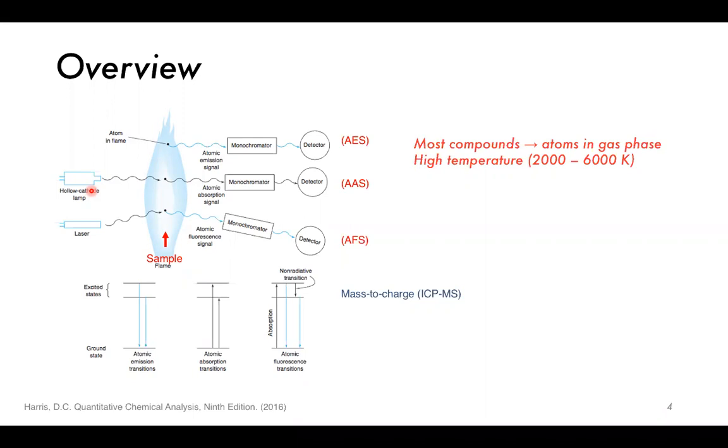that we are interested in, such that we only get absorption from the element of interest and we ignore the rest. This is one of the drawbacks, I guess, of this technique, in the sense that it can't really measure everything at once. You have to measure it one by one in your sample. That's not really a big deal if you're only interested in one thing, but if you're interested in knowing the composition of the sample, there may be other techniques which may be better. This AAS is really for quantitative or analytical measurements.